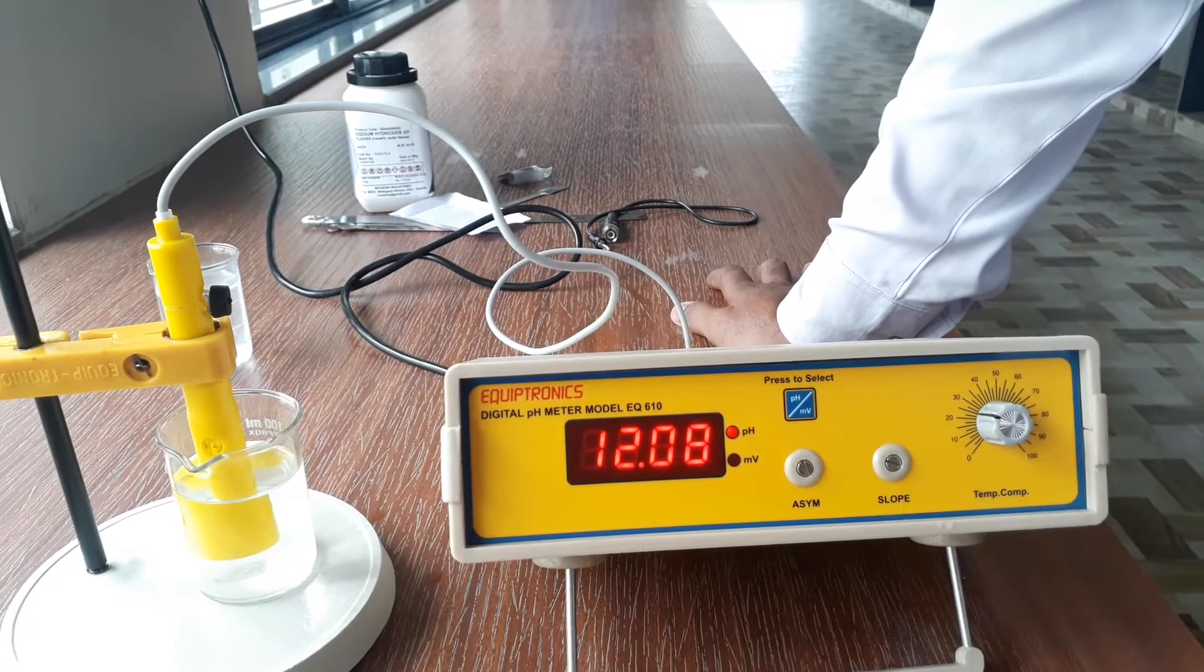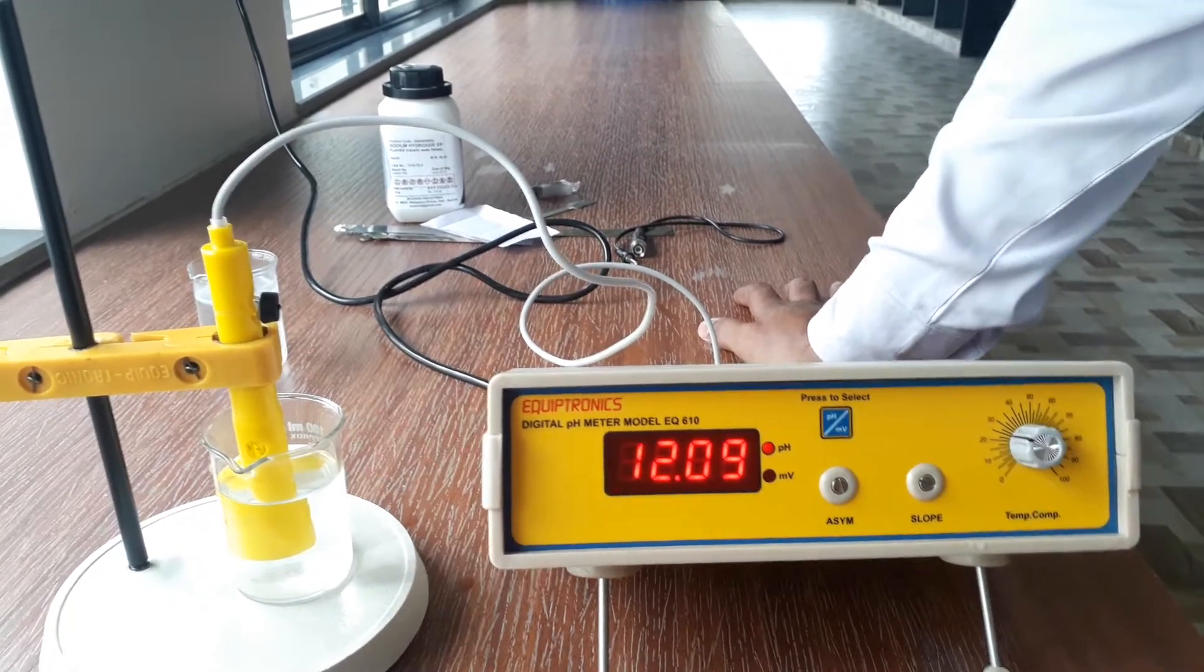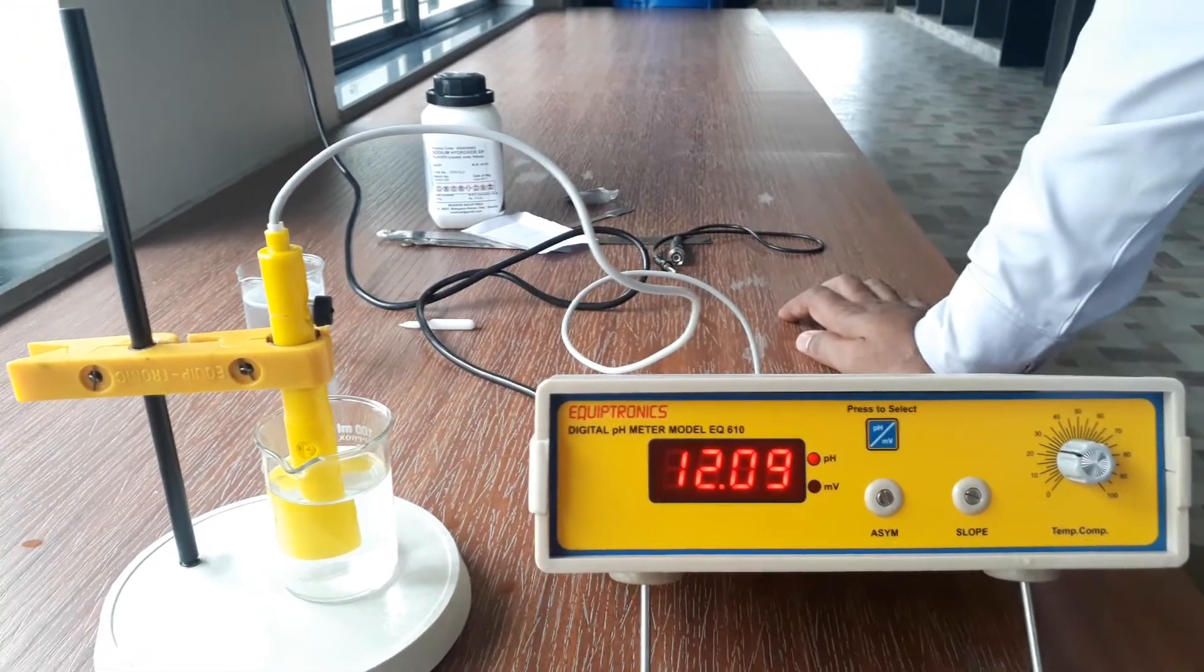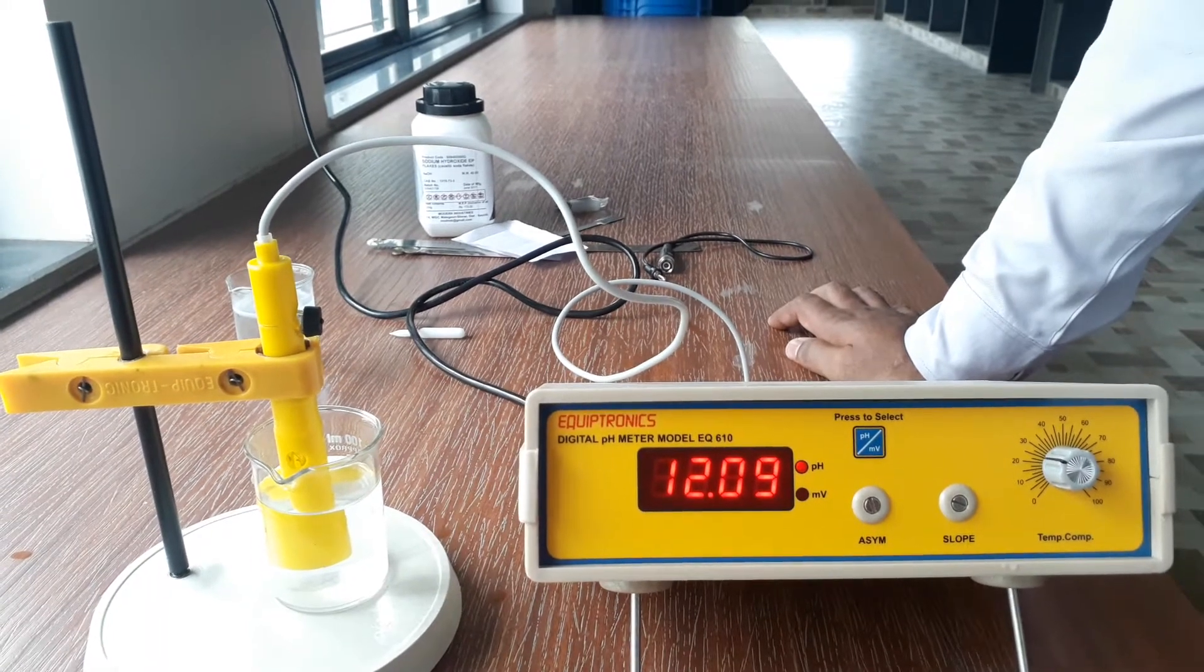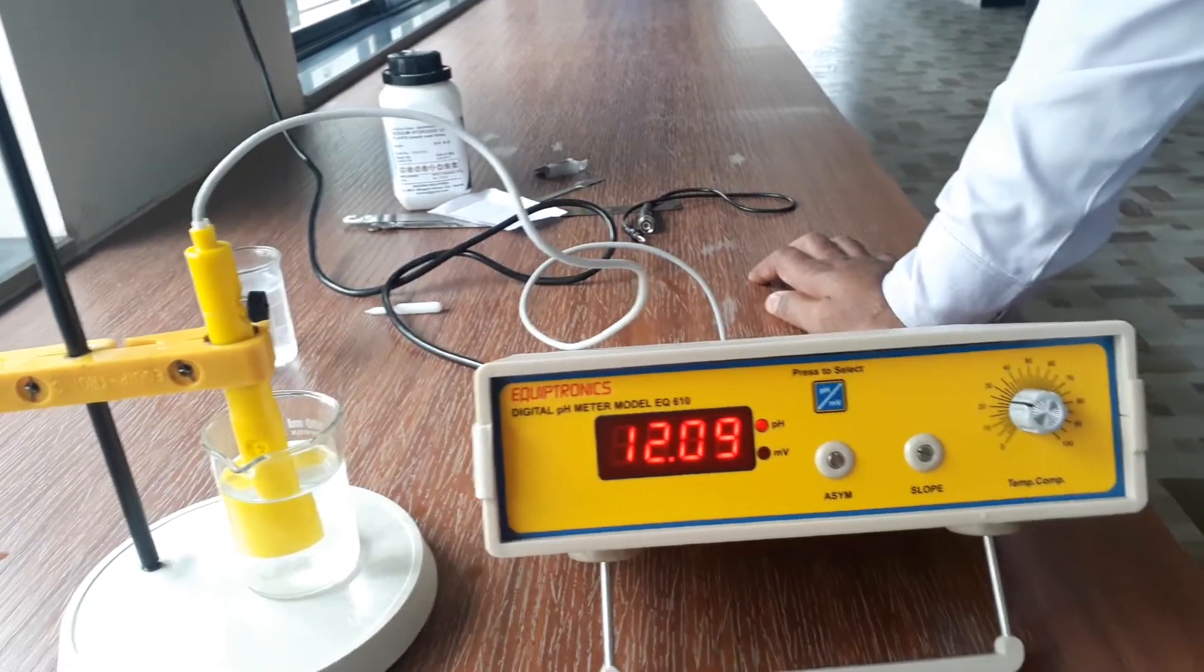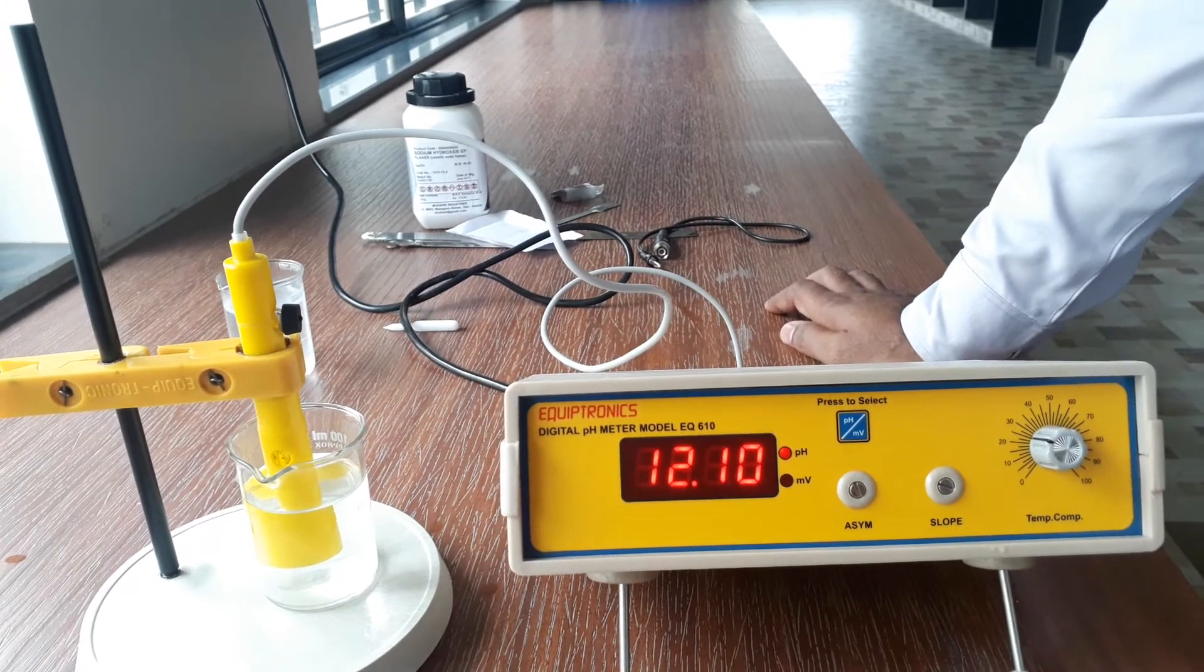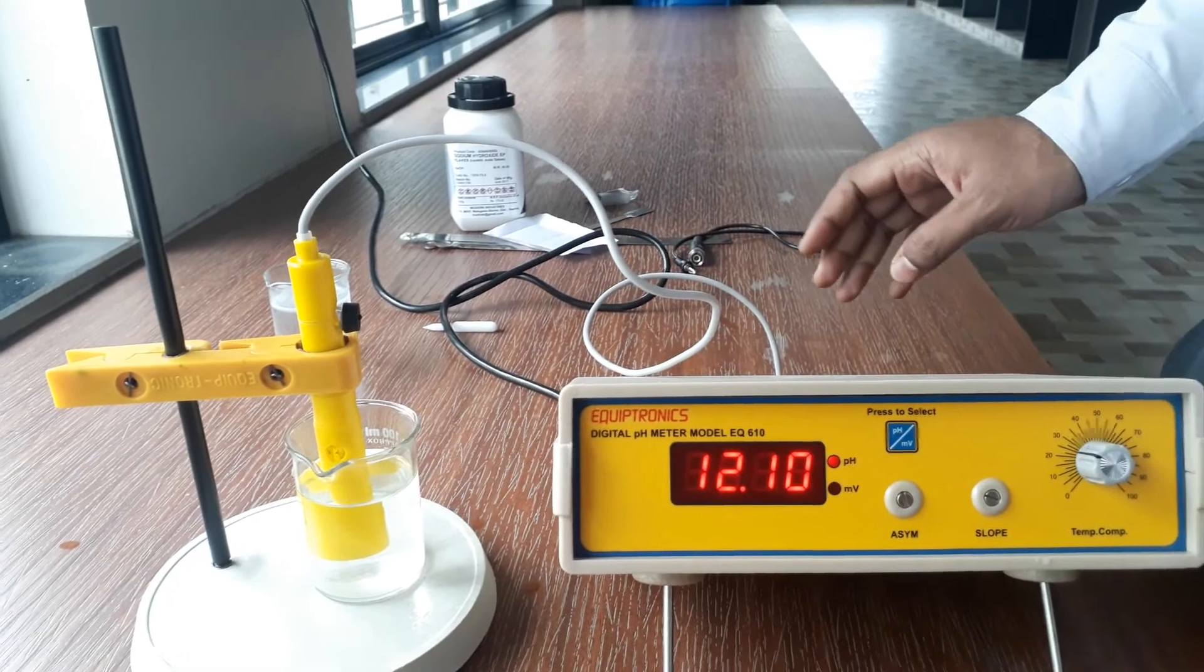This pH meter is used in various industries, laboratories, and various pharmaceutical companies for measuring exact pH. And pH is important in food industry also because pH value should be maintained for proper quality of food. So in this way we have completed this activity. This is only for your understanding purpose, no need to write it, only understand.